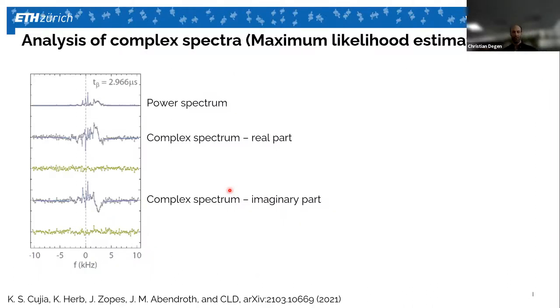This is where it becomes quite nasty. So we have this spectrum here and we have somehow from the spectrum to extract many, many different nuclear coordinates. Let's say you have 20 spins, three coordinates means 60 unknowns. And this works less good or better depending on which nuclei you're actually having. So how are we doing this?